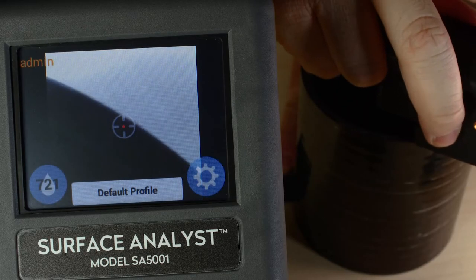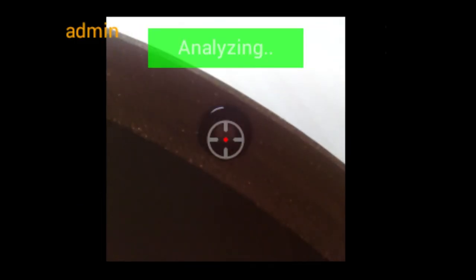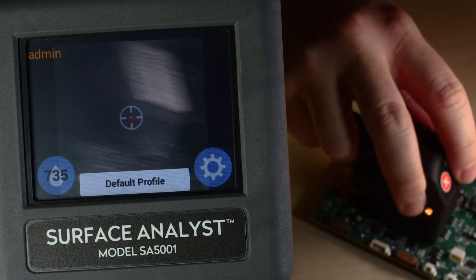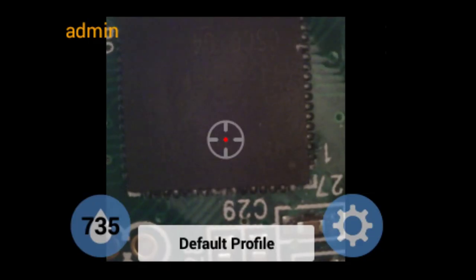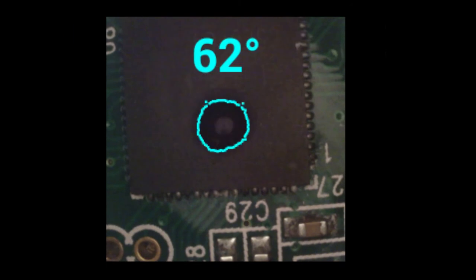The robust ARCHER software is designed to supply precise contact angle inspections on variable material surfaces found in manufacturing environments that are unpredictable. The device equips users with perfect contact angle results in imperfect manufacturing situations.